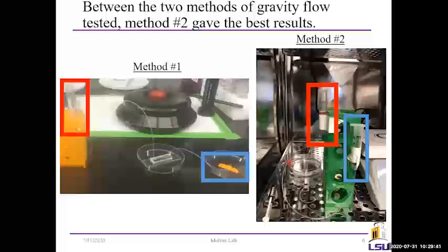Overall, this method was very successful. It worked very well, was easily reproduced, and had a flow rate that was almost exactly on target, with the lowest flow rate I observed being 83 microliters an hour, which is well within the range that we were trying to accomplish. However, there are some limitations with these methods: water often leaks out of the tubing where it plugs into our device, and sometimes we experience evaporation in the water that we're attempting to flow through it, which could have affected results that I observed.